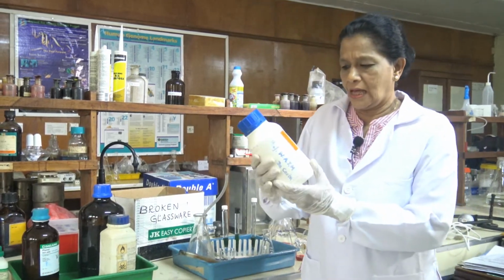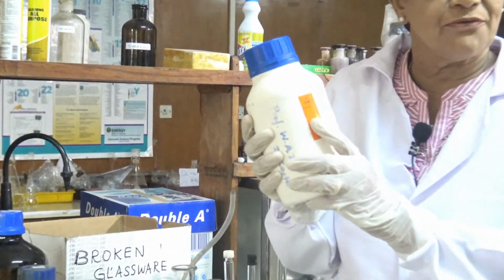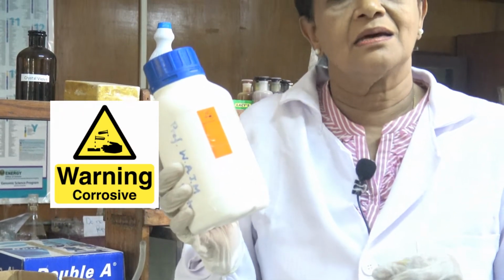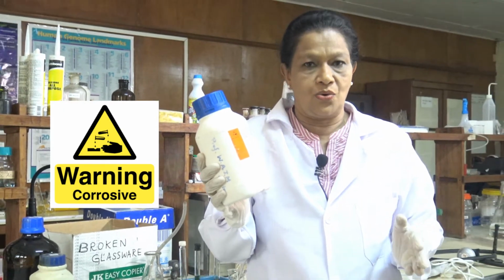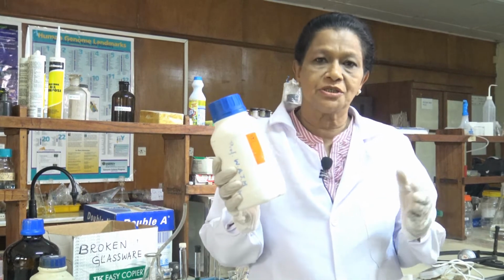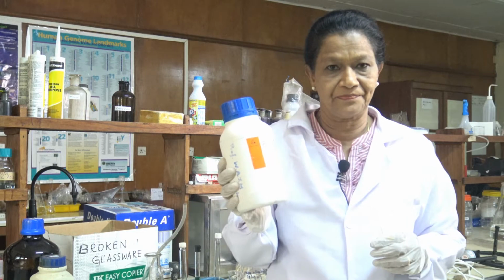The second example is corrosive. Corrosive means a substance that can cause visible discoloration, destruction or irreversible change in tissues at the point of contact.